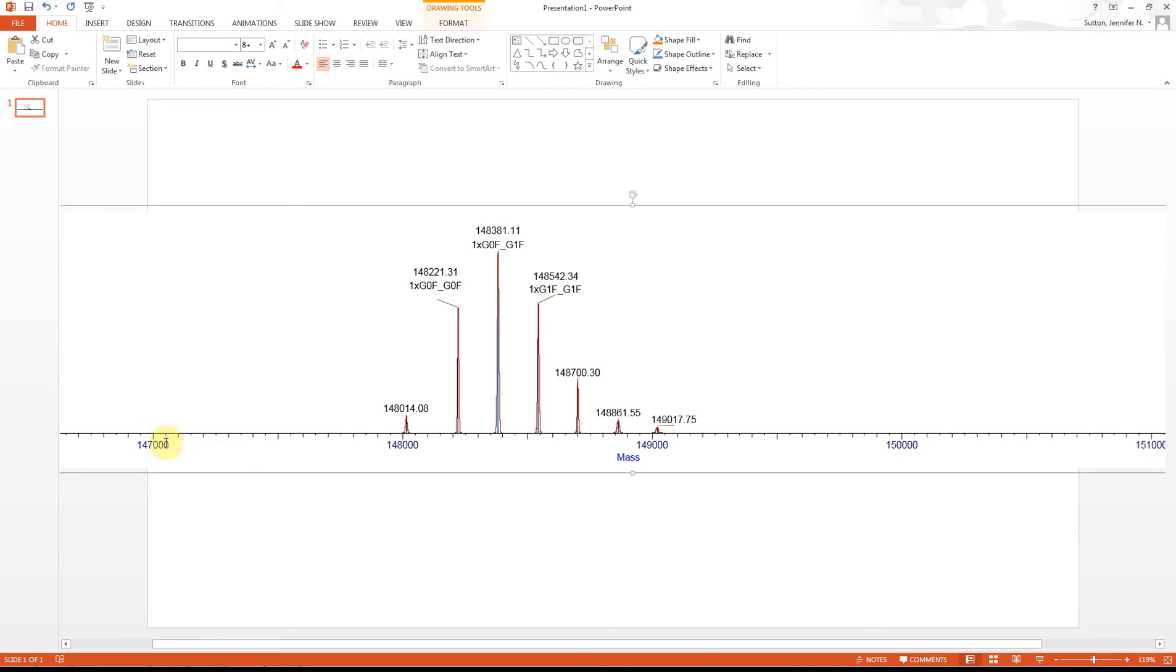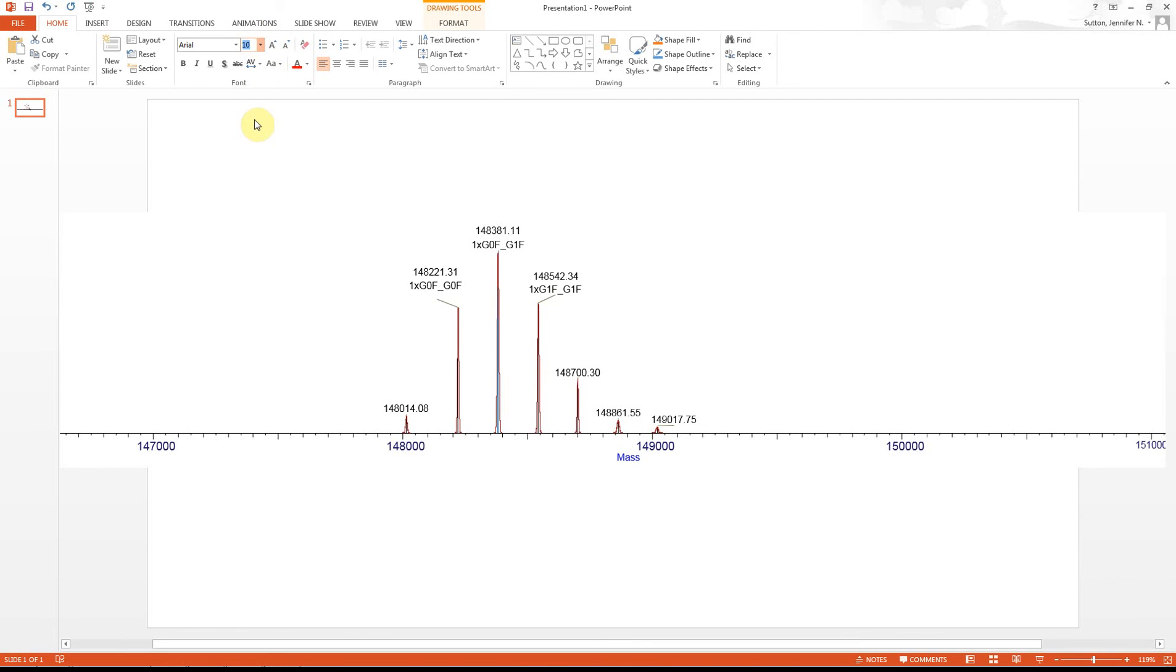Then you can also change the size. Hold Shift down, and then up here you can change the size. You can do that for the mass as well.